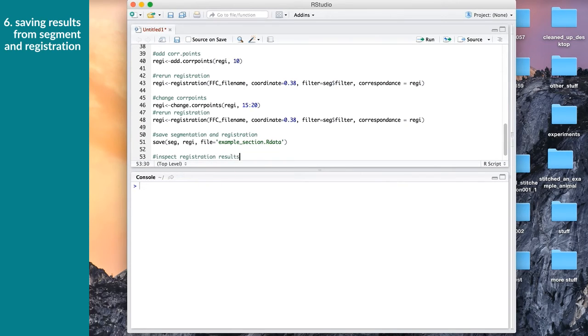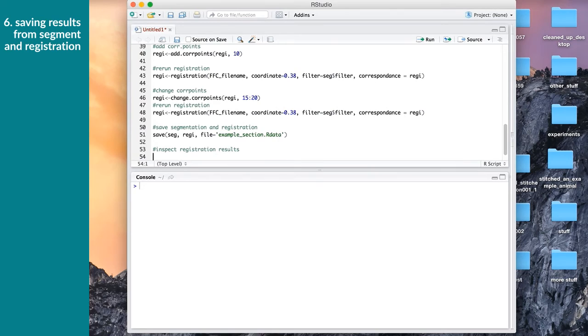Basically plotting the registration results, and when we do this we can also immediately get sort of like spreadsheet data from where each cell is in the brain, like which brain area, already when we do this inspection, which I sort of highly recommend when you just do this one simple brain section. Maybe not when you run multiple brain sections, then it's other things in order to look at your data if it's accurate or not.